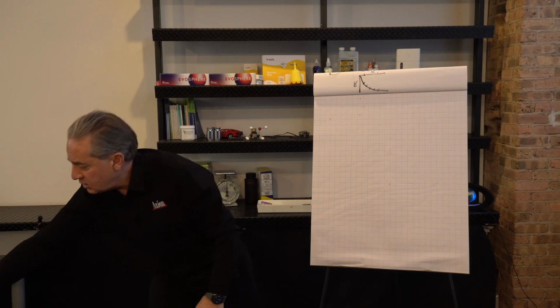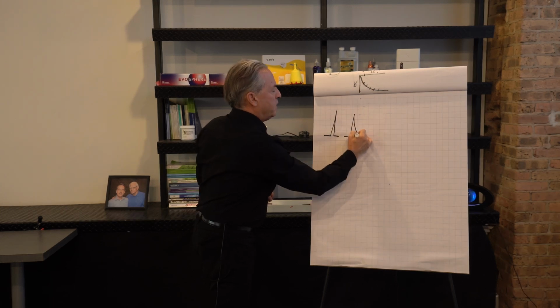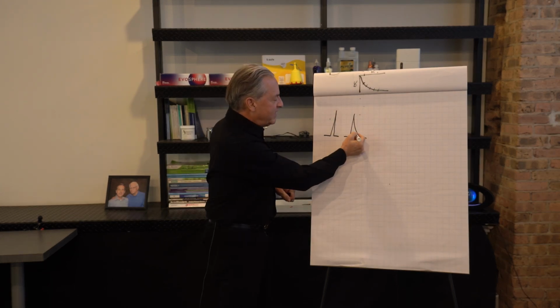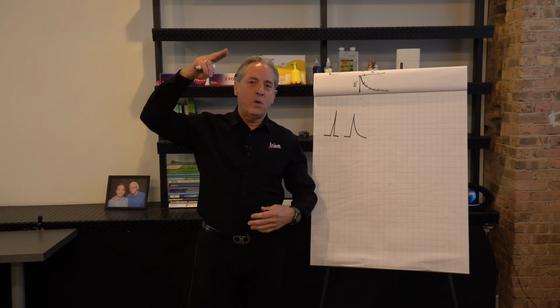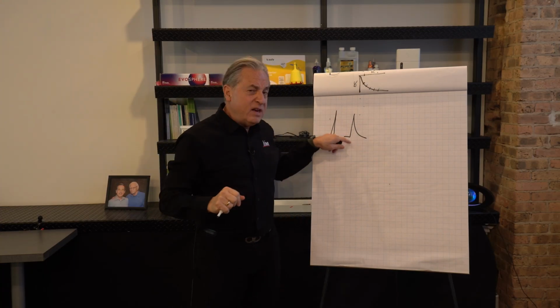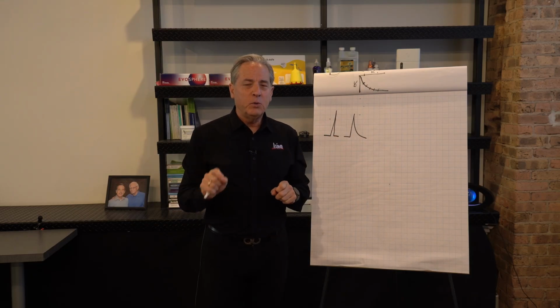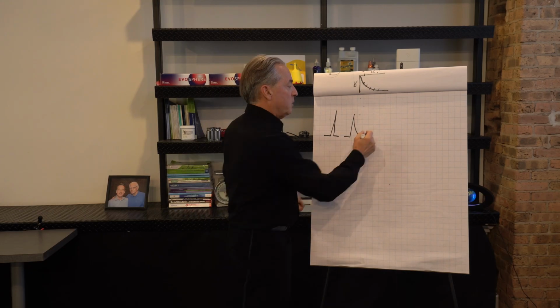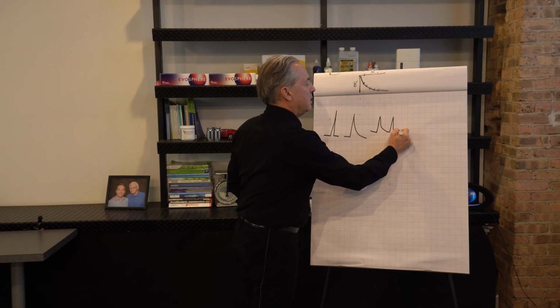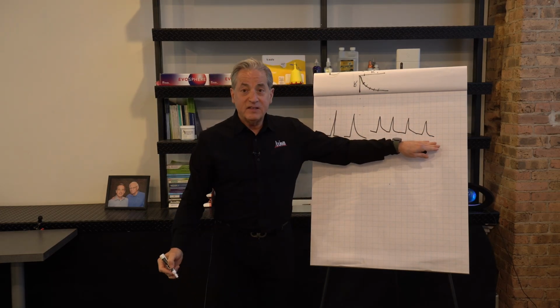and that causes a peak to tail. So if you think about it, ideally we want a peak to be symmetrical, but a tailing peak would be something that looks like this. So this tailing is due to that infinite dilution of those bad fittings. So again, a void in the top of your column, a bad fitting in the instrument, too much tubing in the instrument will cause tailing. Now that's a physical problem, which means every single peak in your chromatogram will tail. If you have a physical problem, you will get tailing peaks. Again, every peak will have a tail on it. That is a physical problem.